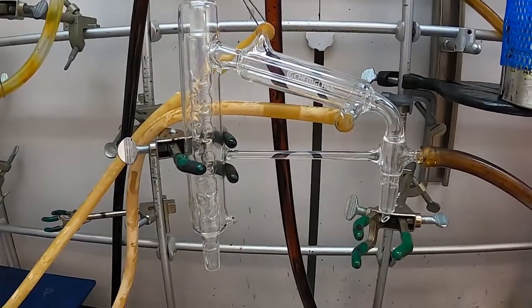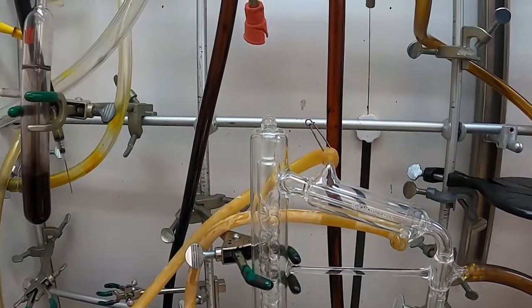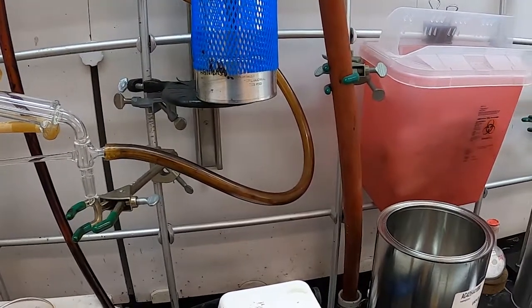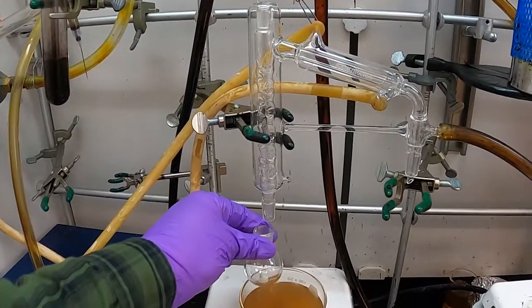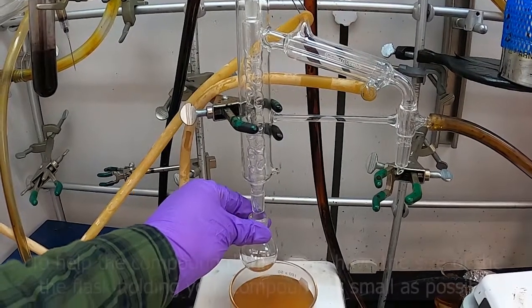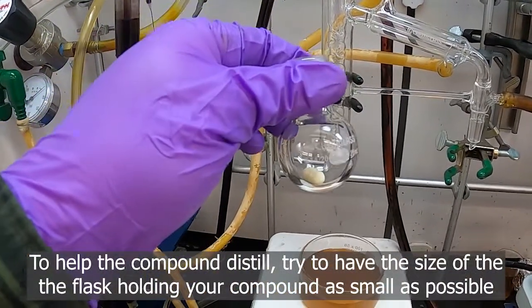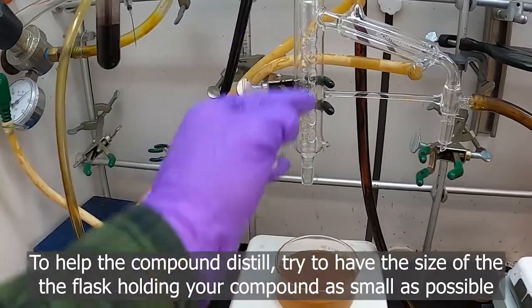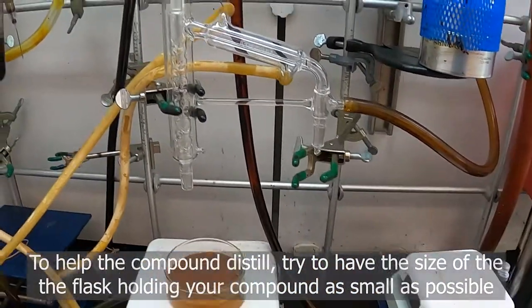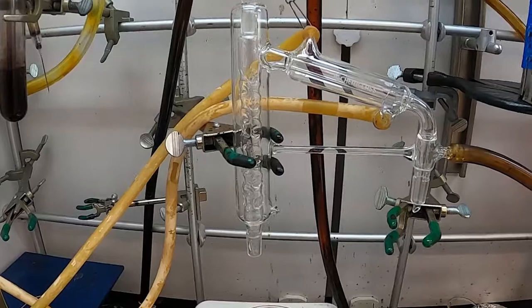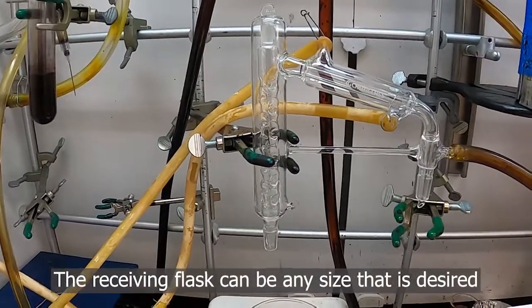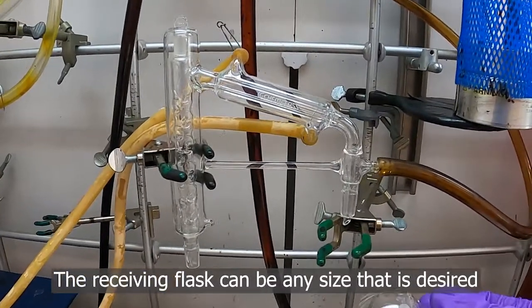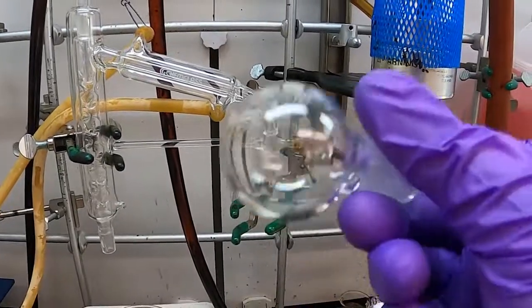One of the key things with distilling is that the flask that you attach to distill from, you want to be as small as possible so that you have very little extra space in the top of your flask, because you want the vapor of your compound to move over. If your distilling flask is too big, it will make that process slower. What you receive into can be whatever size you need.